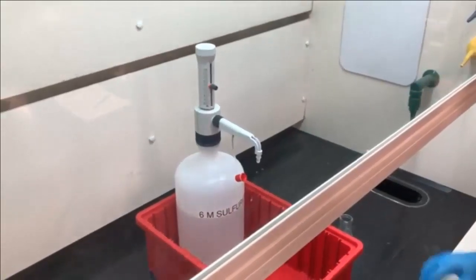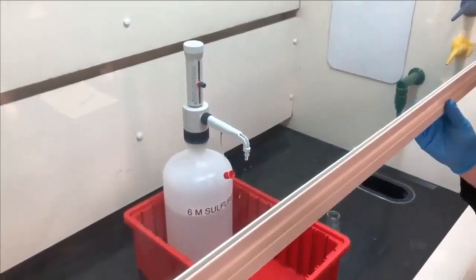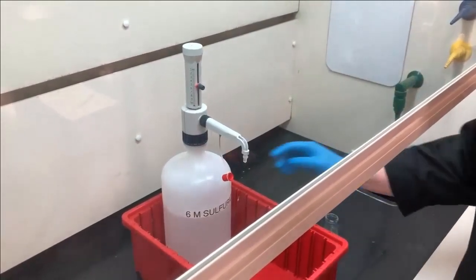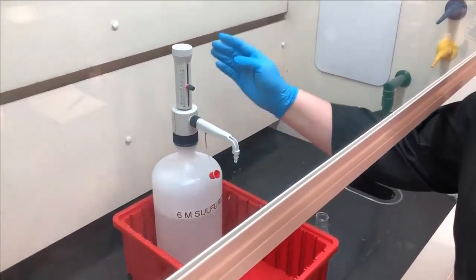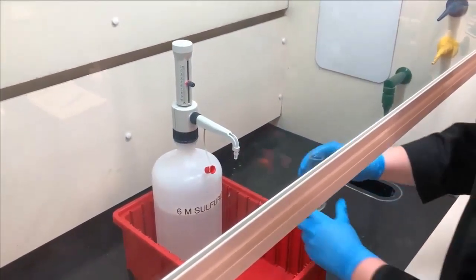This is a close-up view of a reagent bottle dispenser. In this case, we have sulfuric acid, and we have a 10 milliliter reagent dispenser attached to the top of it. With all things in lab, we want to make sure that when we use this or any other chemical, we're underneath the fume hood. This has a protective cap on it, so that has to be removed before we actually run the dispenser. And right now, that dispenser is set at 5 milliliters.